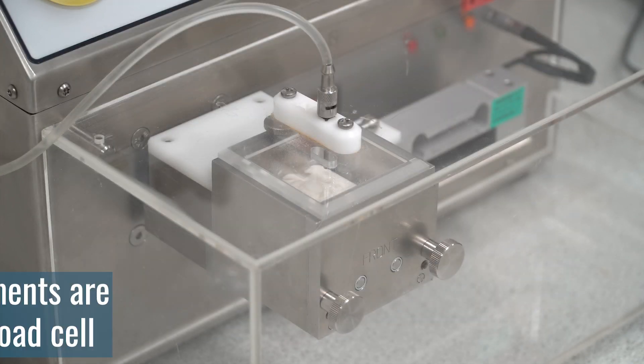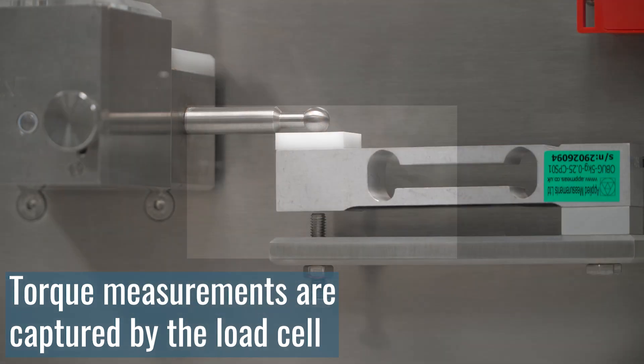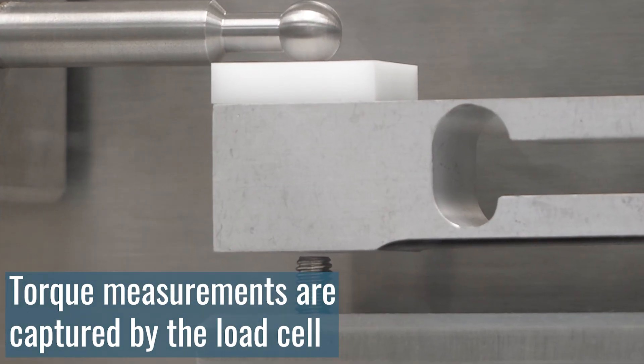Torque is generated inside the mixing bowl, which is then registered by the MTR's load cell, and saved onto the MTR control panel.